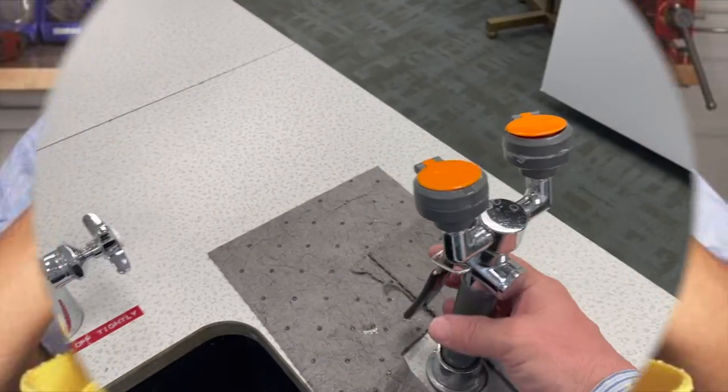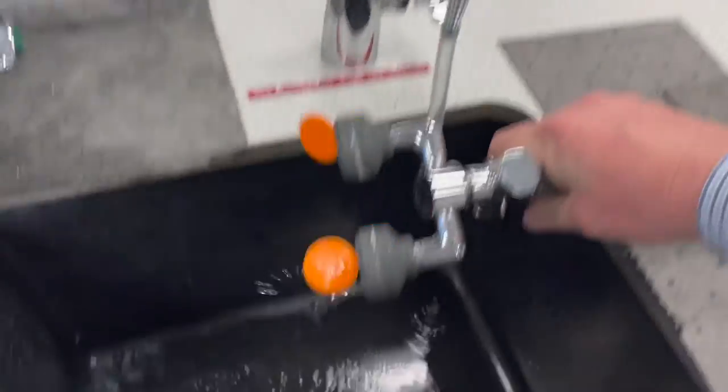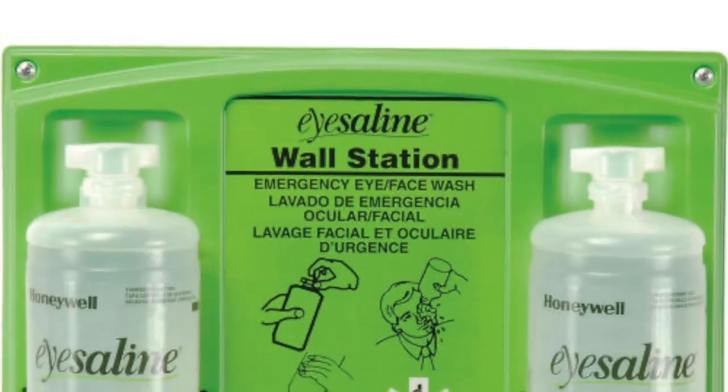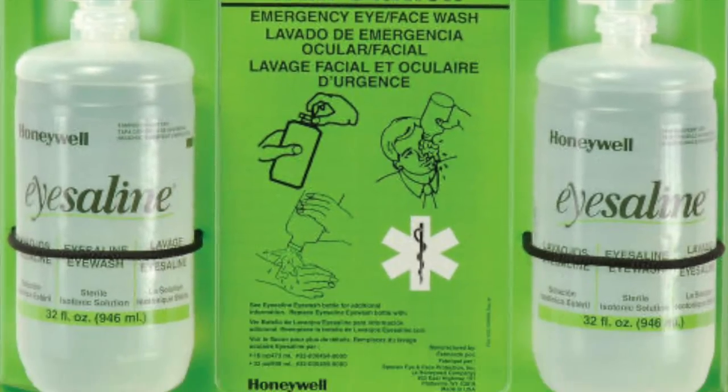Drench hoses can also help provide first aid in an emergency. Personal eyewash bottles don't meet the OSHA and ANSI requirements and are secondary to a plumbed or gravity eyewash station.